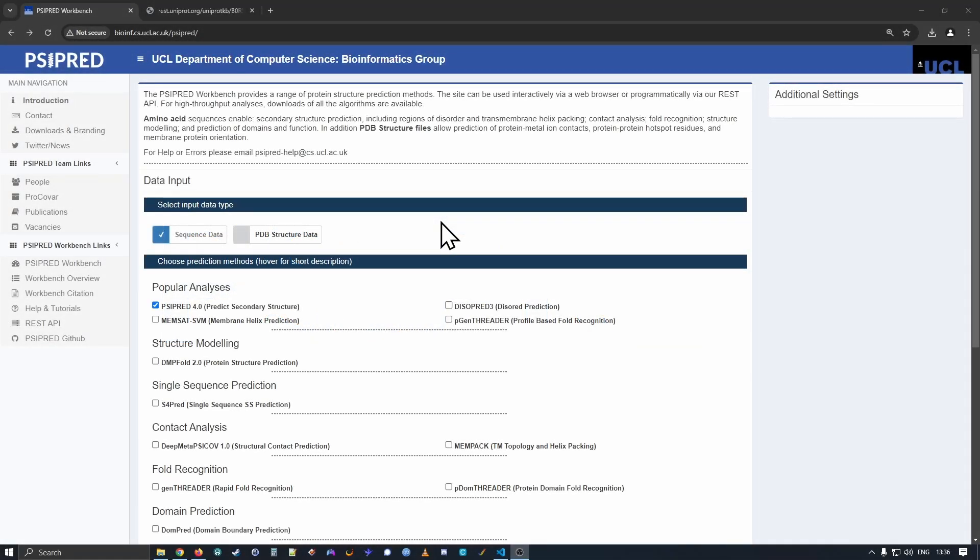Welcome to the first of our tutorials in using the PSIPRED Workbench. This is the web services of the Bioinformatics Group at the UCL Department of Computer Science. Today we're going to be looking at using the PSIPRED Secondary Structure Prediction Tool. This is a machine learning method for predicting secondary structure for protein sequences.